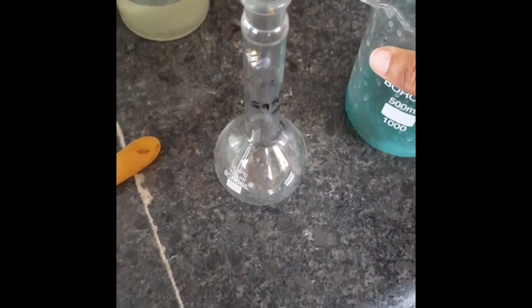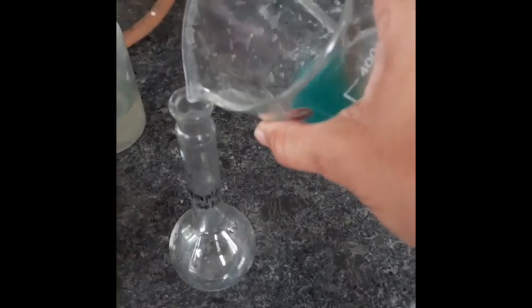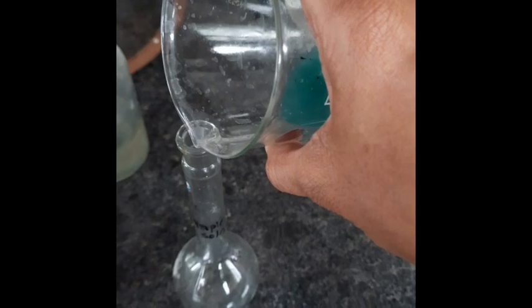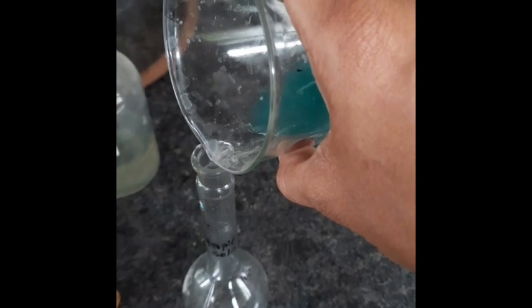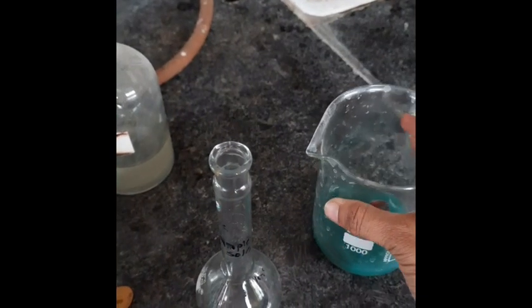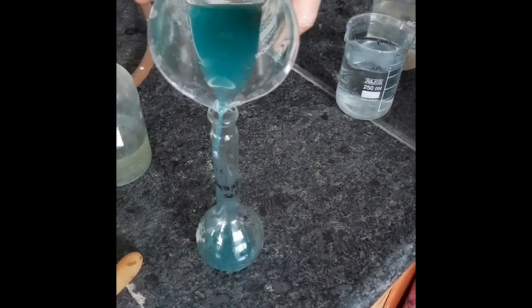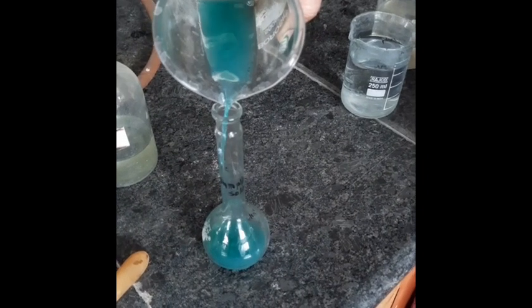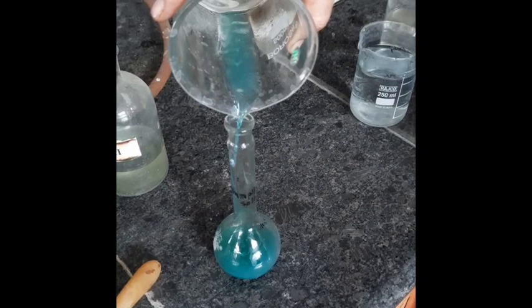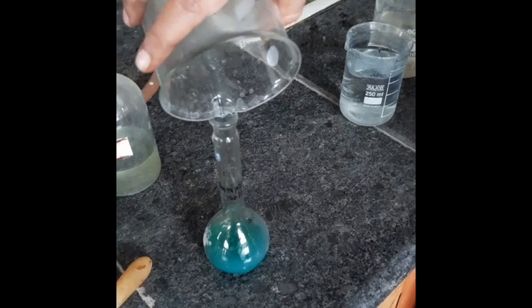Now the solution is completely cool. Now I am going to transfer this to the 100 ml volumetric flask. Okay, this is the 100 ml volumetric flask. Transfer this solution into this 100 ml volumetric flask. Yes, transfer it if you are perfect, otherwise you can use the funnel for transferring the solution. Transfer it to your 100 ml volumetric flask and dilute up to the mark using distilled water.